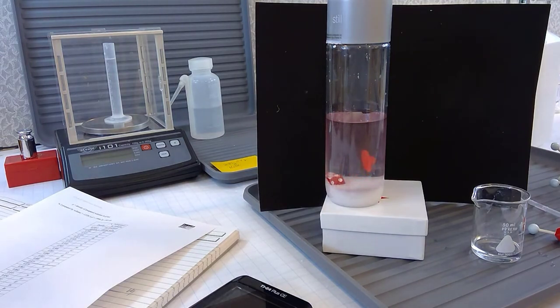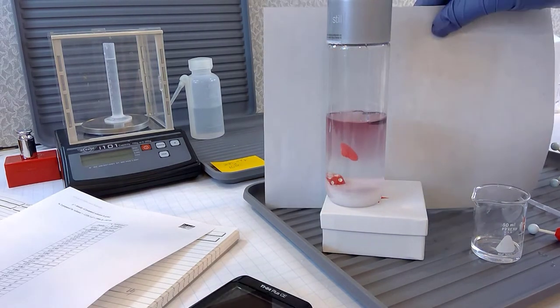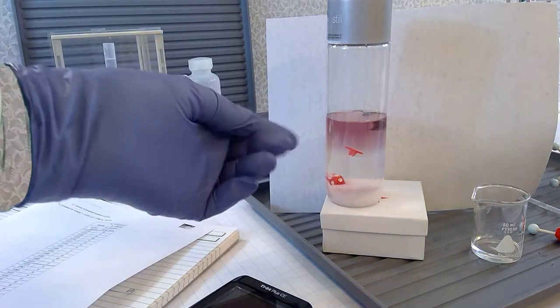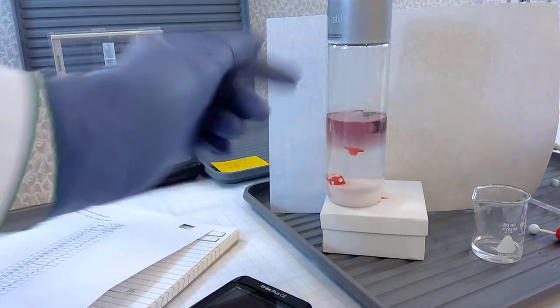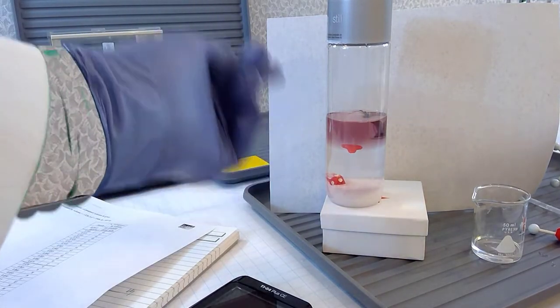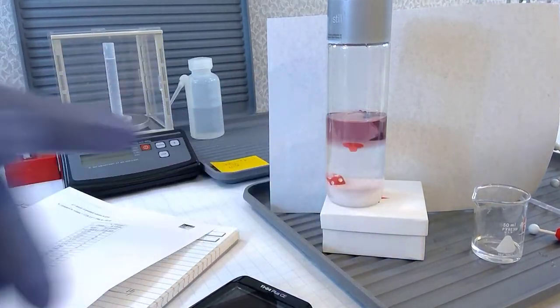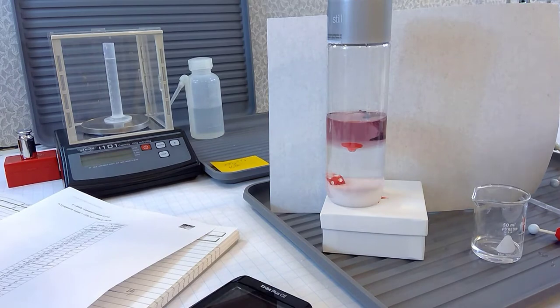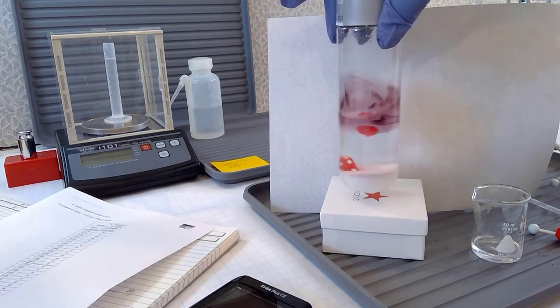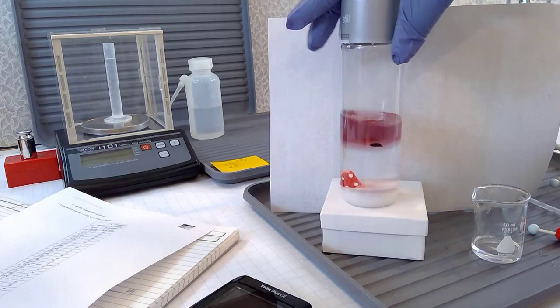And let me put a white background there right now. I'm going to flip this over. You'll be able to see the coloration a little bit better. The non-polar magic marker dye dissolves in the propanol. So if you want to get rid of magic marker, get yourself a high isopropanol mixture, 2-propanol, because look, it's not dissolving in the water. There it is. A little arrangement, and that is just amazing. These little molecules and their solubility and intermolecular attractions, wow.